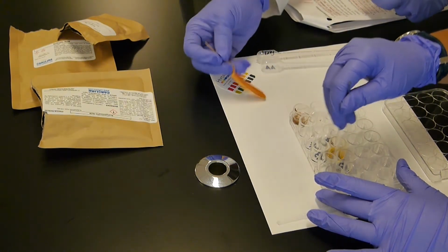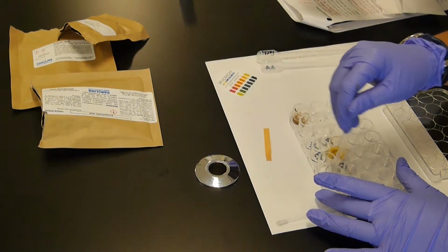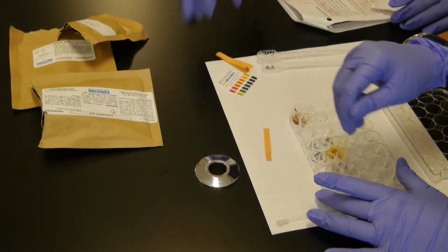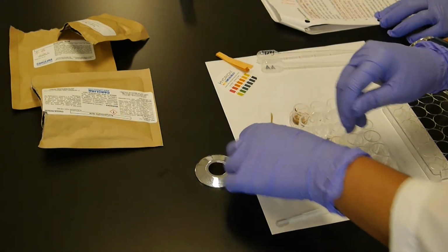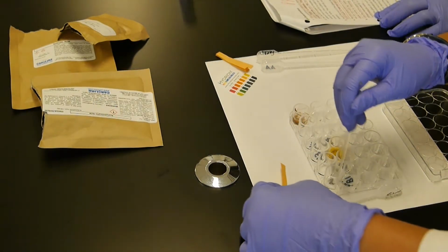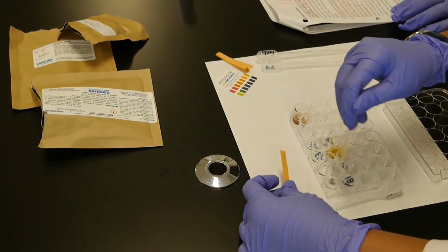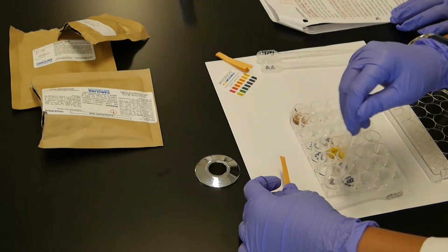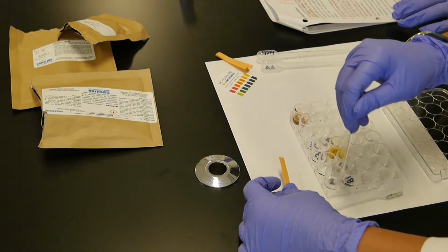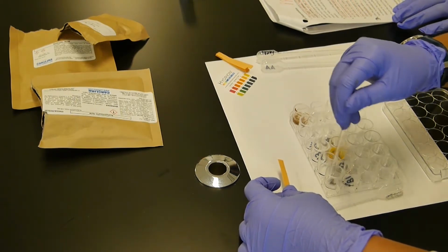Oh wow, you have the pH paper. Look at that. I'm touching the end of the glass stirring rod onto the piece of pH paper to test the salicylic acid solution. Once we test it, you will write your observations in your lab report.